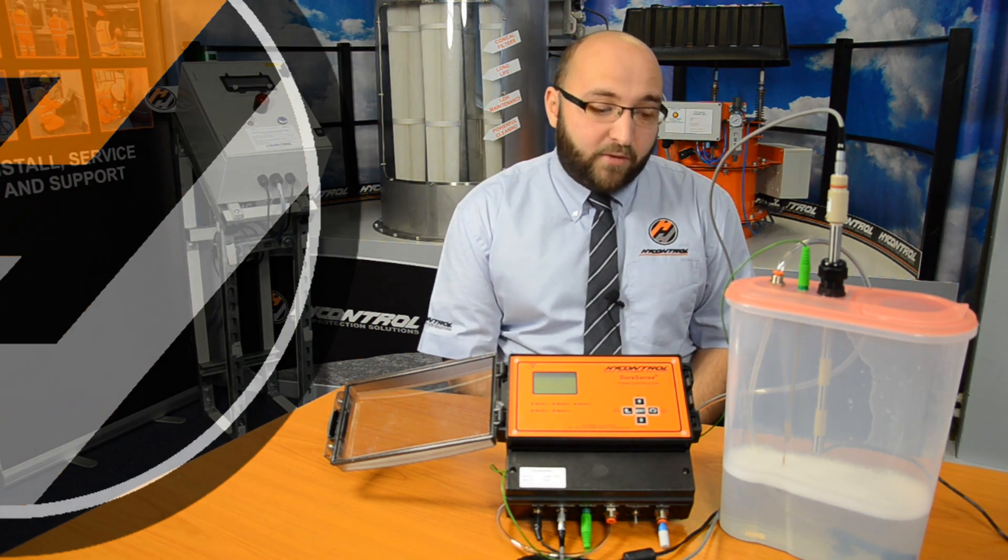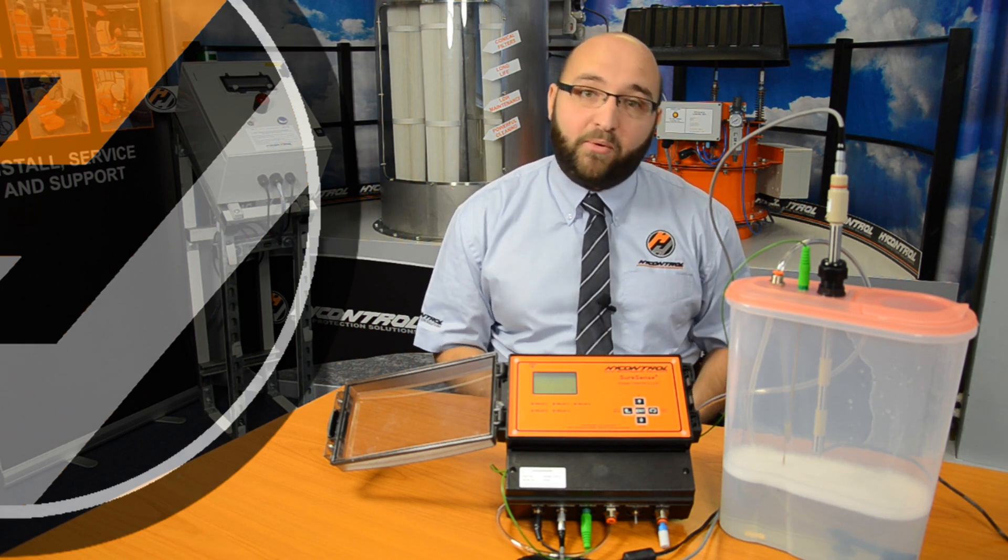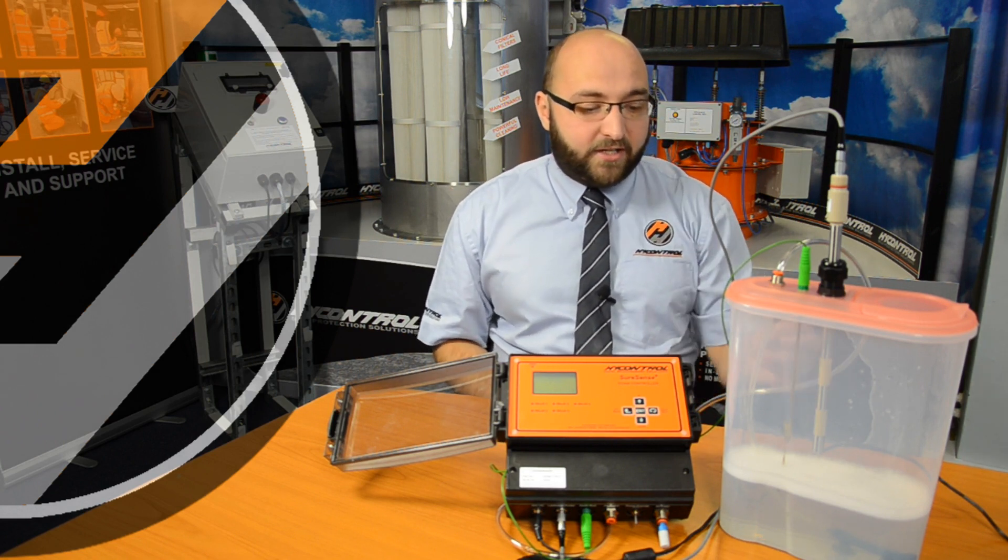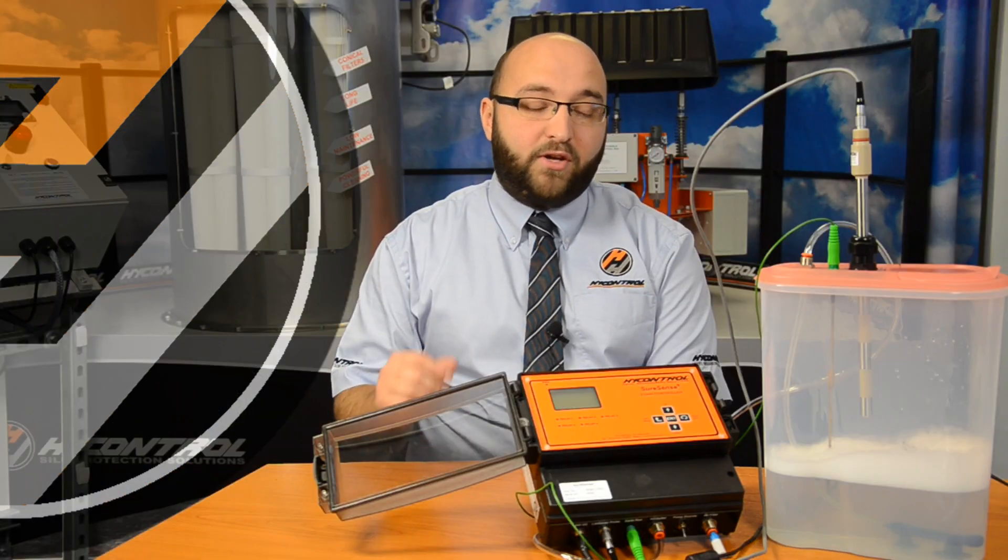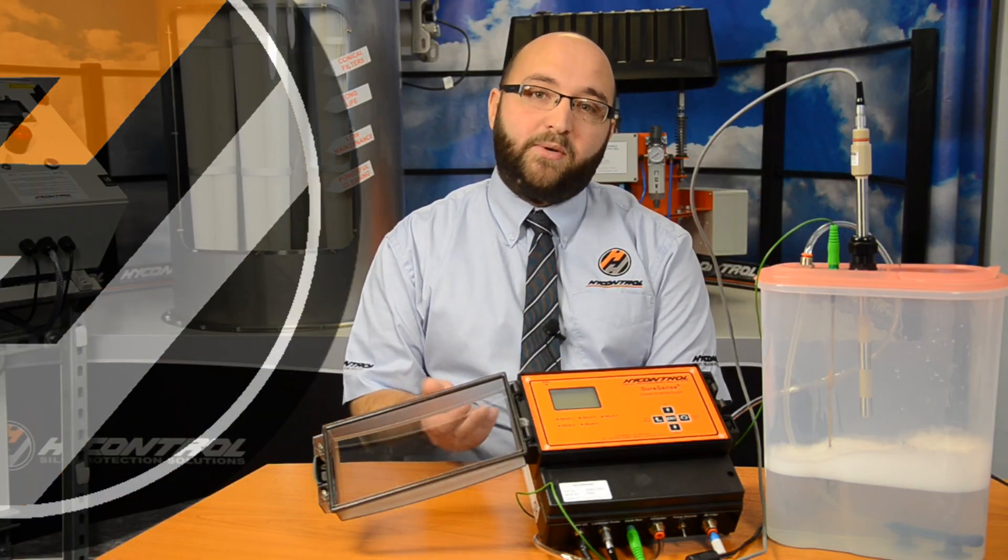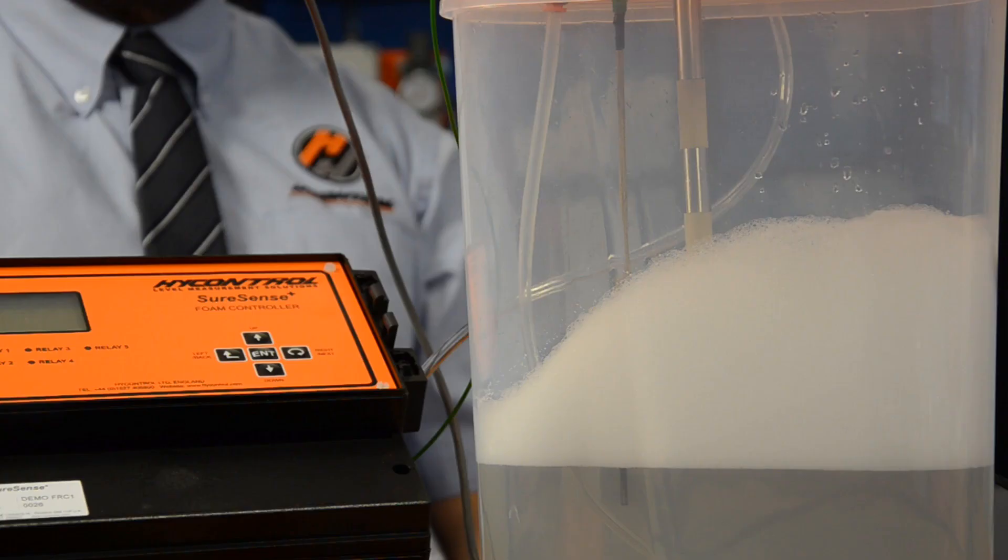Foam itself is unpredictable and complex. You can have light foams that you'll find in your washing up or bath to dense thick bubbles that you'd find in a beer or anaerobic digesters. Foam is also not homogeneous throughout, so close to the liquid surface you'll have wet dense foam and at the top of a foam column you'll have dry airy bubbles.